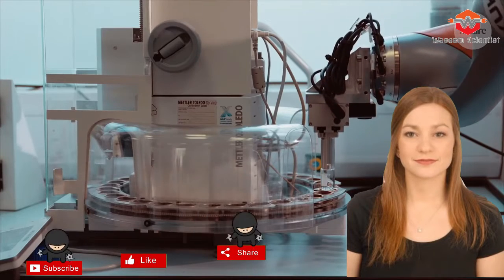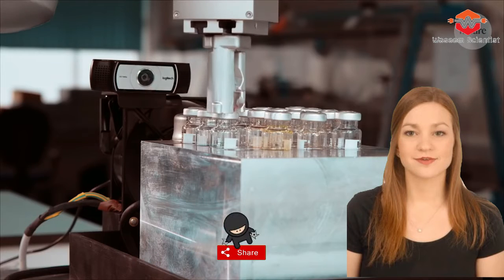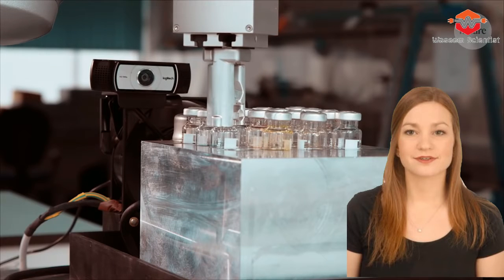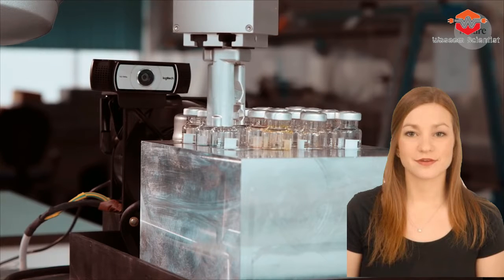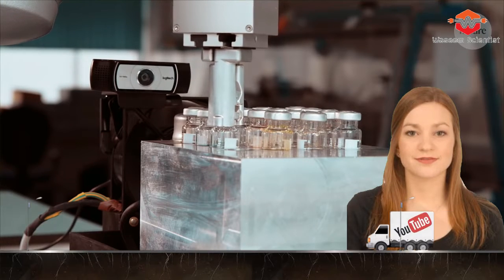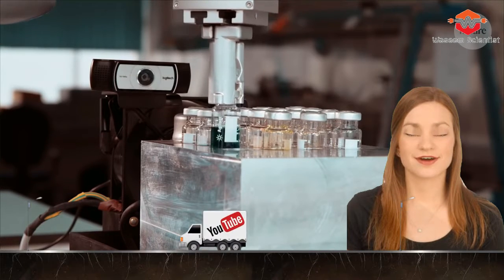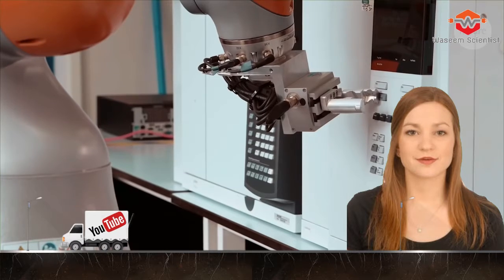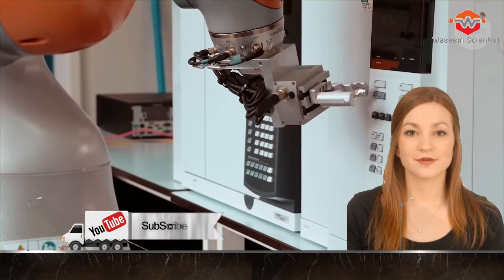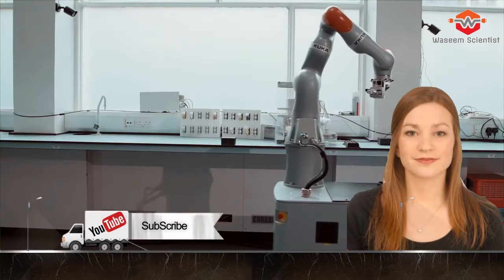In this first run, researchers at the University of Liverpool let the robot scientist loose in the lab, with the goal of investigating new catalysts for splitting water into hydrogen.